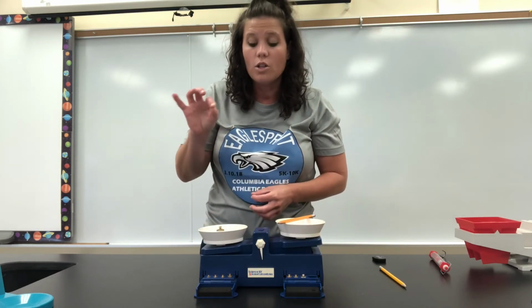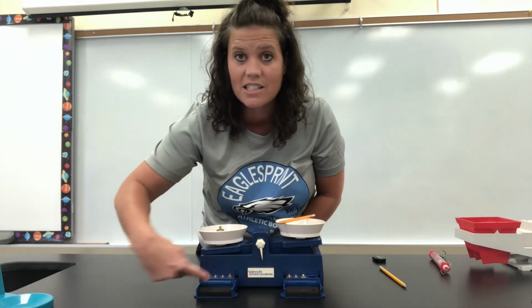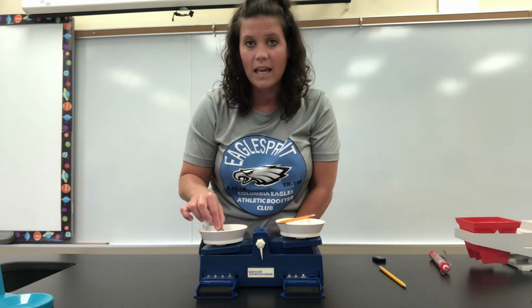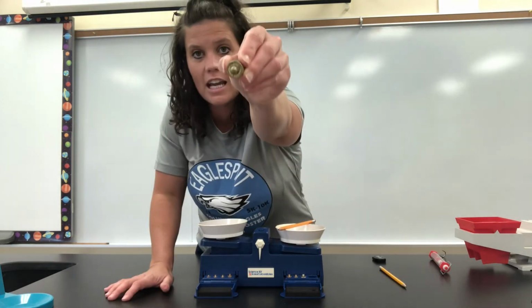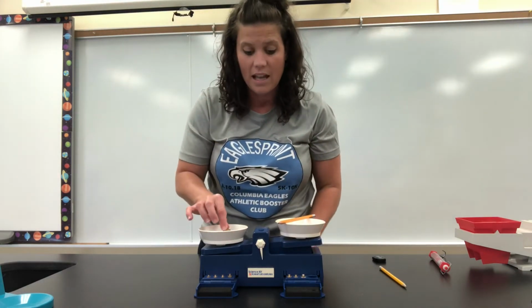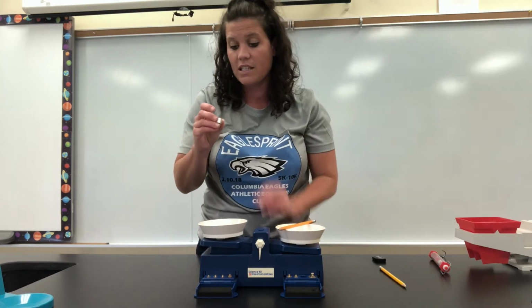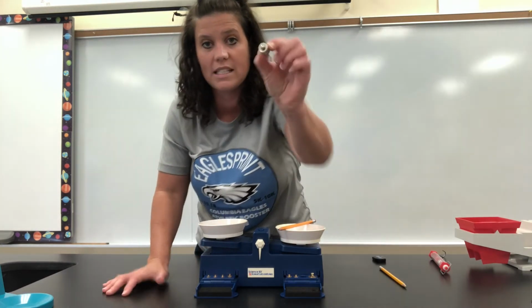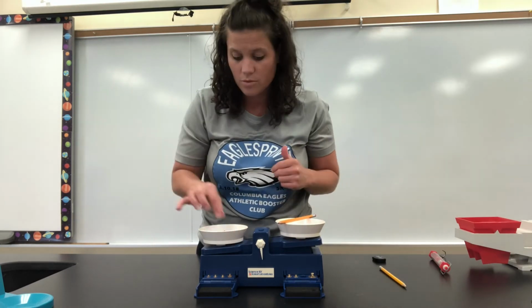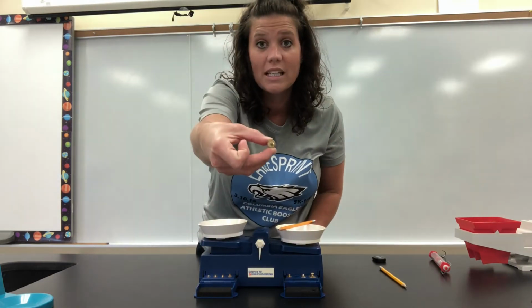When you are using your gram weights, you always want to start with the heaviest and go further down to the smallest or the lightest. So you see this weight, which on it says 50 grams, was way too heavy, did not balance it out. It had too much mass, so it was heavier. This one is 20 grams. So now I'm going down my size here. Again, too much mass, too much matter in this. This is the smaller one, it's 10 grams.